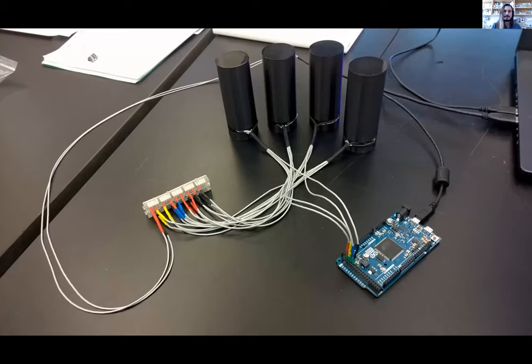And one of the really interesting parts about this is that you can use the same chip to make a plate reader. One of the things on the back burner right now, because I can't have access to a ton of these light sensor chips, is to build a really cheap plate reader, ideally under $400, where you just put in your 96-well plate. It has 96 light sensors, 96 programmable LEDs or laser ports or whatever you'd like, and you have the super modular plate reader as opposed to $4,000 for a really crappy commercial version.